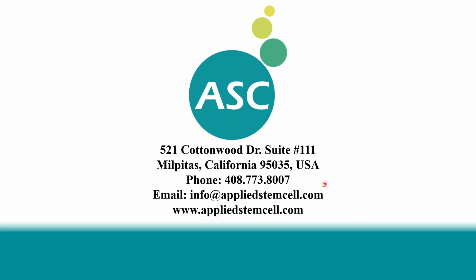The next question is, can you also generate polyclonal antibodies in parallel with monoclonal antibody development? We usually use a spleen from the animal for monoclonal antibody development, so that you can still save the serum for polyclonal antibody generation. So these two processes can be run in parallel, i.e. you can get the polyclonal antibodies as well as monoclonal antibodies from the same immunized animal, either a rabbit or alpaca.